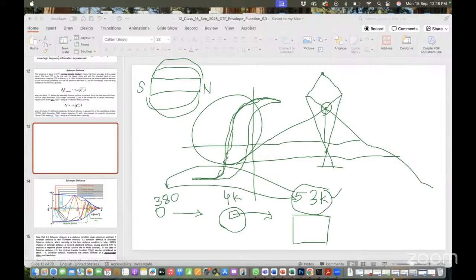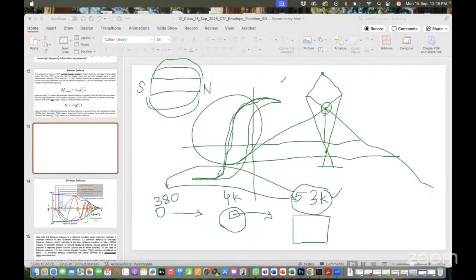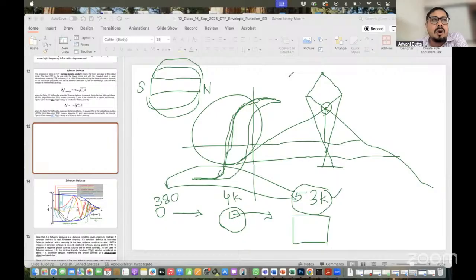Okay, and what steps should we follow to ensure that even if we have to go from low to high mag, this hysteresis doesn't come into the picture? It will be better to give some time. How long? Generally it is very difficult to tell exactly how long. This depends on your resolution also.